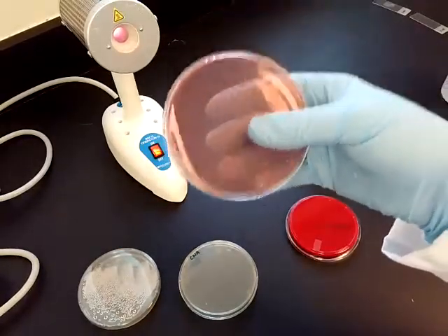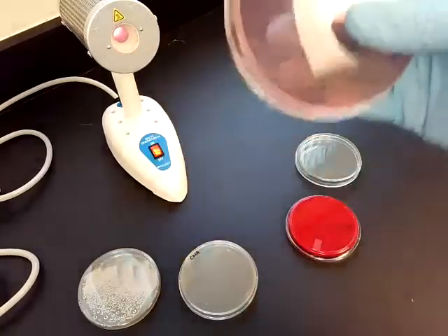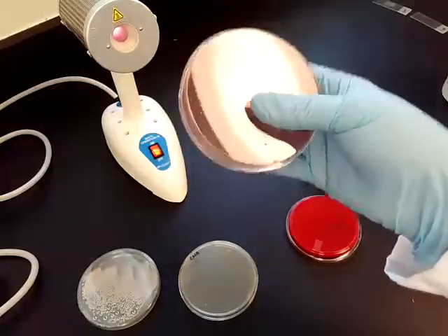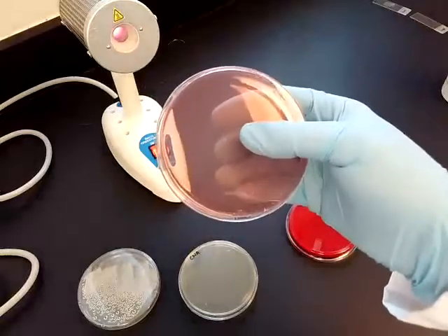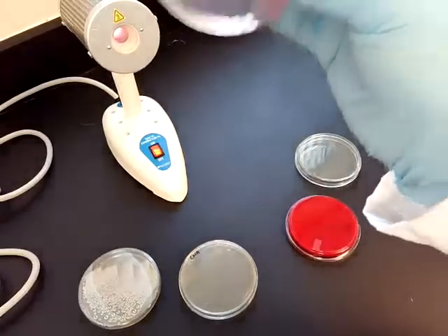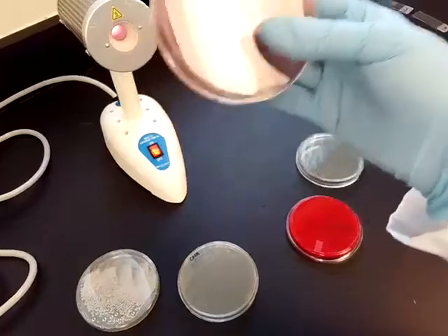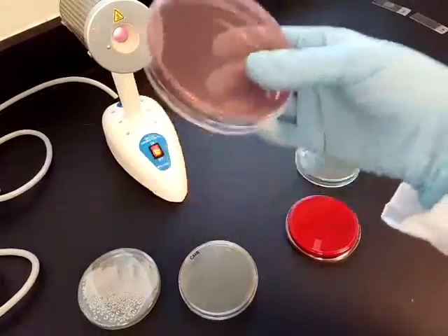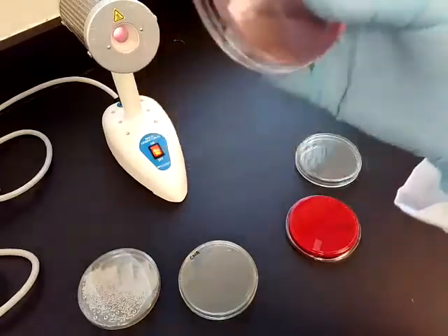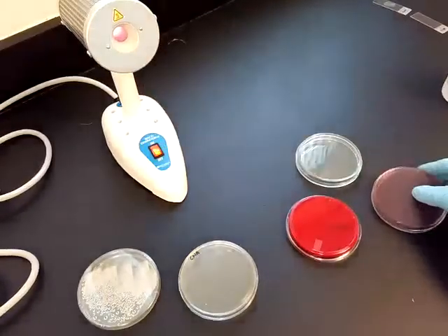Some enteric pathogens have the ability to eat lactose. It's known as lactose fermentation, and some don't. So if they do have the ability to eat lactose, they're going to turn pink in color. If they don't, they are going to just grow the natural color that they normally grow. So selective and differential, and this one kills off the gram-positives, so it selects against gram-positives. It only allows gram-negatives to grow, so that it selects for gram-negatives. And then it's differential based on lactose fermentation. It'll grow a different color based on its ability to eat lactose.